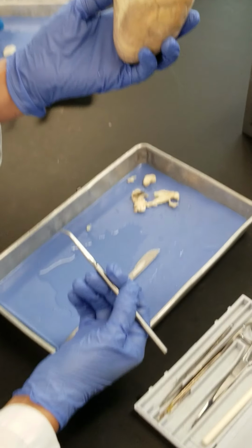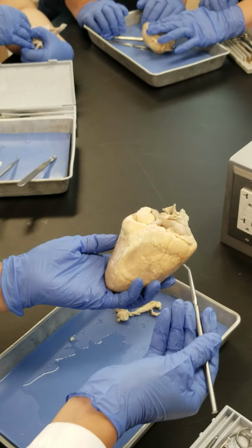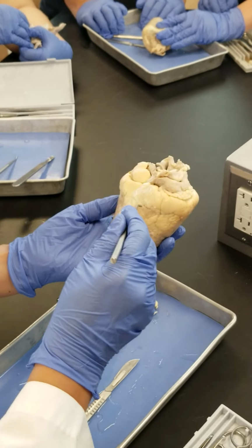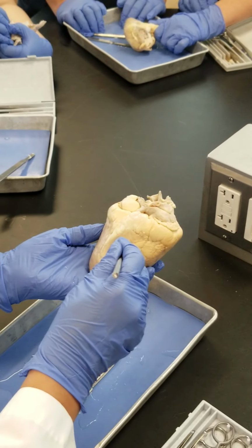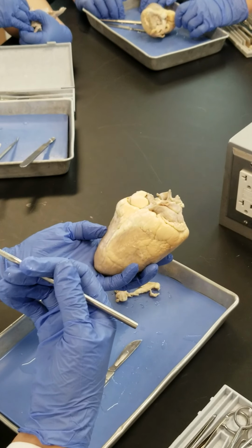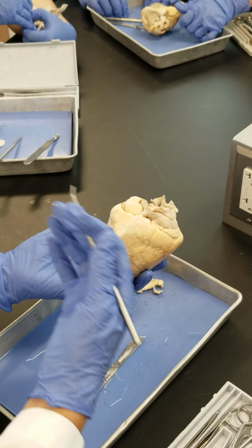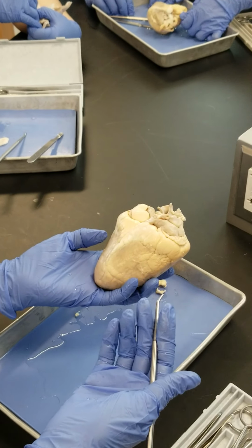You're looking at the back of somebody, right? So the sheep is like somebody too, right? So this is the right ventricle, this is the left ventricle. If you keep this in mind and recognize the anterior and posterior, right and left, you won't be lost, right?